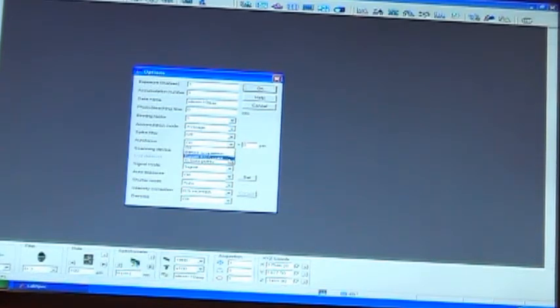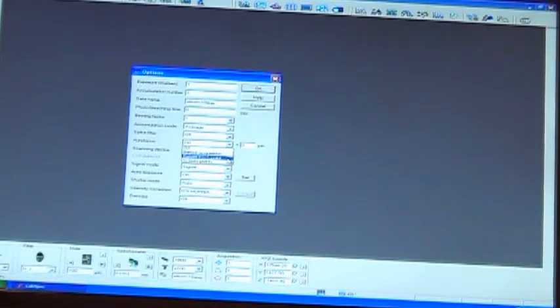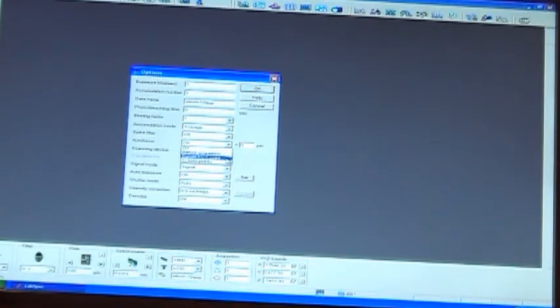If you select before each point, if you're doing a map, at each point, it'll try to autofocus for you. And it'll adjust the focus at every single point, then acquire the data. Any of these options that you turn on will exponentially make your map longer. So if you have a 15-hour map and you tell it to do an autofocus before each point, it's probably now a 17 or 18-hour map. Every little option that you add makes things go longer.